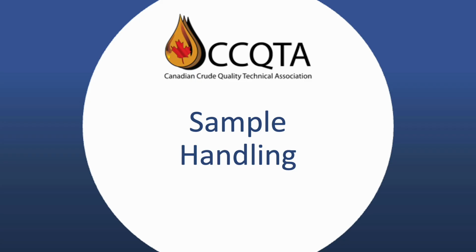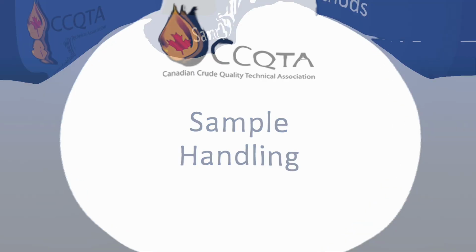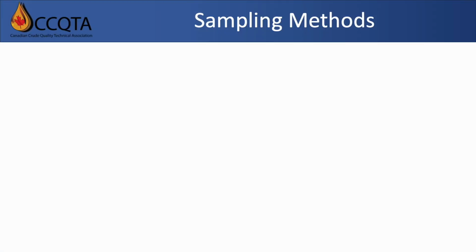Sample handling, including collection, homogenization, and subsampling, are critical to ensure the success of any analytical test. If a sample is sampled incorrectly or handled poorly, the results of any subsequent testing are going to be wrong or misrepresented. Water is normally dispersed in the oil as free or emulsified water with varying droplet sizes. Therefore, collecting a sample of flowing product at various time intervals would not be expected to provide samples with exactly the same content of water.